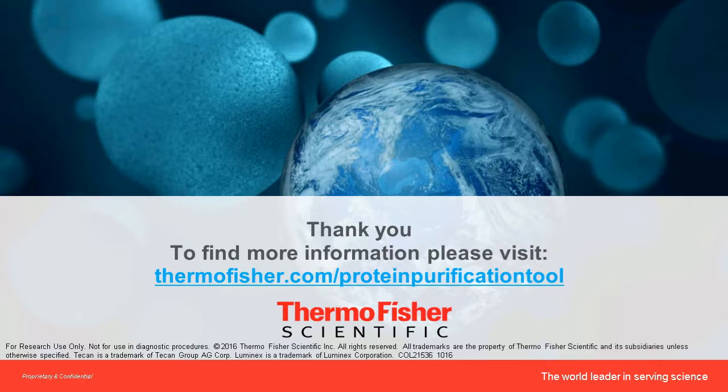Yeah. So if you just Google antibody verification by mass spectrometry, you should be able to get to the white paper. It's usually the first hit, from Thermo Fisher Scientific, and the title is Characterization of Antibody Specificity Using Immunoprecipitation and Mass Spectrometry.